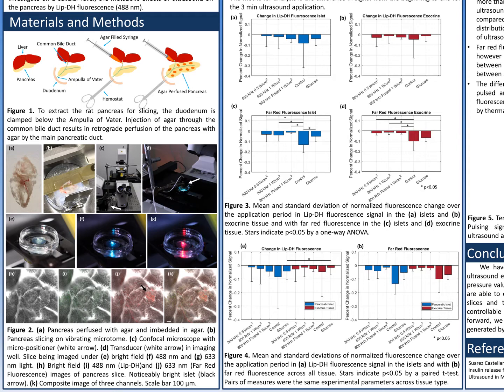Figure 2a shows the pancreas filled with agar, embedded inside of agar to provide stability during the slicing, which can be seen in figure 2b. Figure 2c and d show the imaging setup with the therapeutic ultrasound transducer. The therapeutic ultrasound transducer is highlighted with a white arrow in figure 2d.